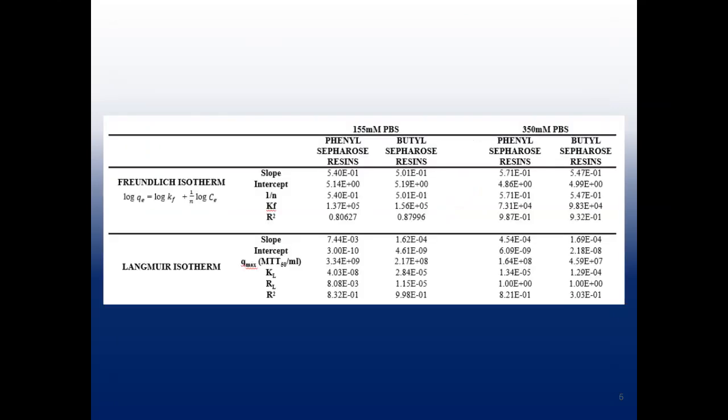The experimental data is fitted into adsorption isotherm graphs of different theoretical models, Langmuir and Freundlich. These models are the standards for analyzing adsorption isotherms. Langmuir isotherms are based on the surface of the resins being homogeneous, whereas Freundlich isotherms are based on non-homogeneous surfaces. The model with the best fit was the Freundlich model and is the model used in the graphs. This is because the data points line up the best with this model fit.